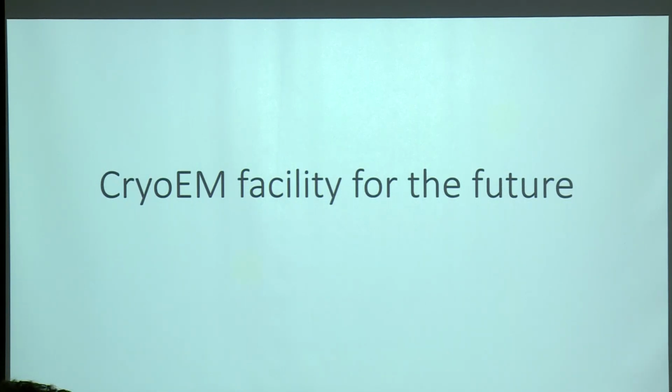Okay, so that's to sum up the first section of the talk, which was more focused on the sample preparation. The thing I want to run through next is thinking about the future of cryo-electron microscopy and where things are going, because I think this is such exciting technology. We had the resolution revolution when we started to get Titan Kryoses being installed, when the new direct electron detector technology went in.